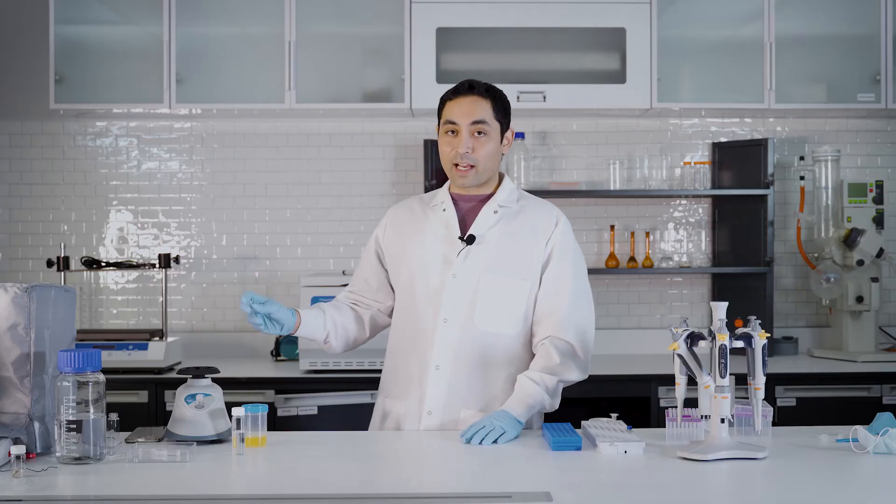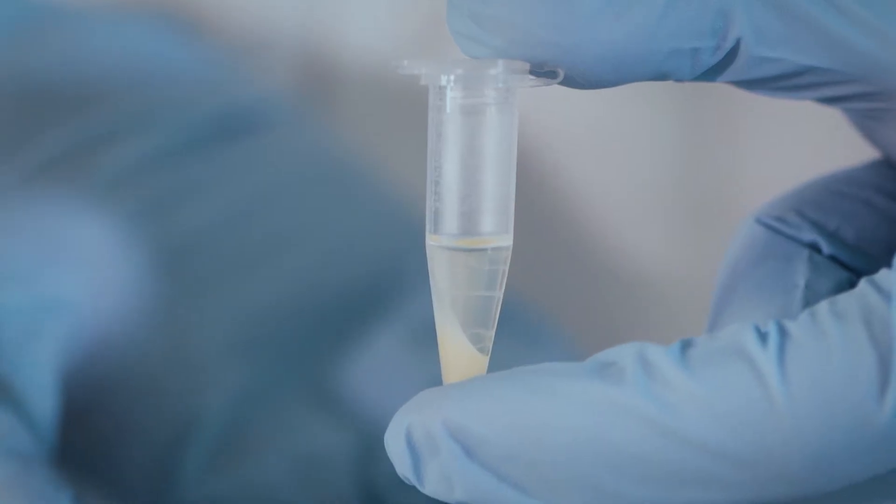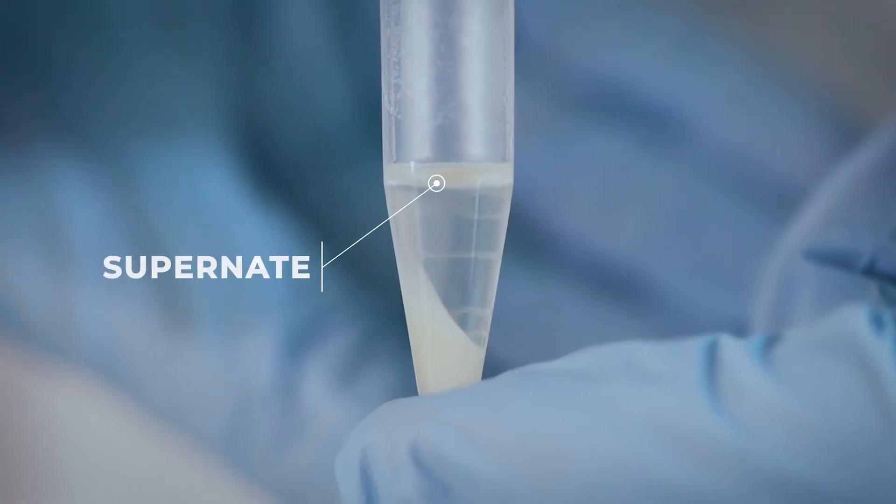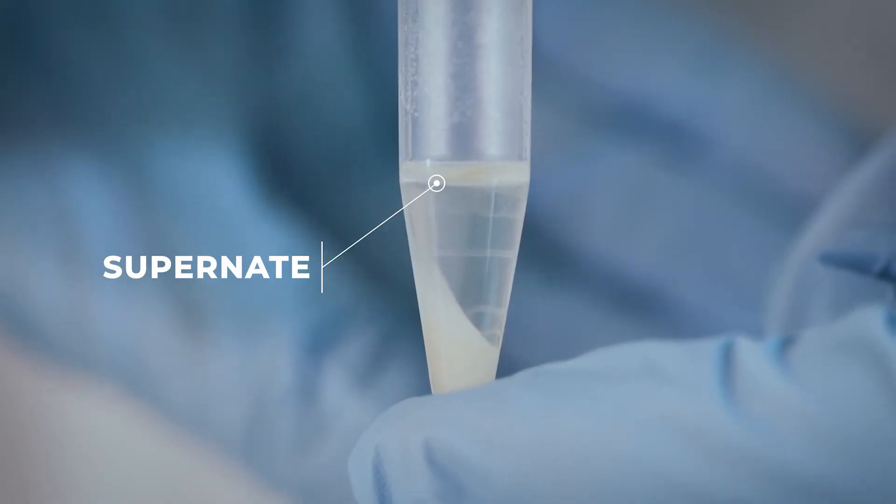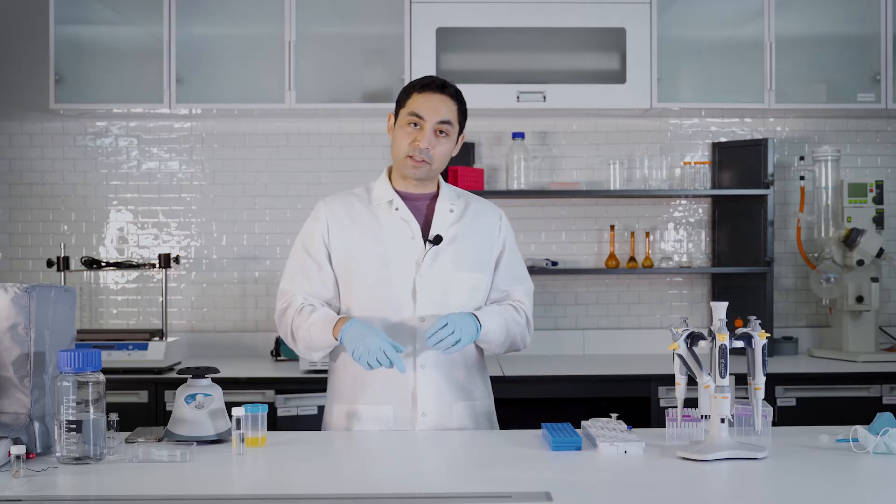Now that it's spun down you can see that there's two layers and then we just want the supernatant, which is just the stuff on the top. So we're gonna take that and we're gonna get that into an HPLC vial.